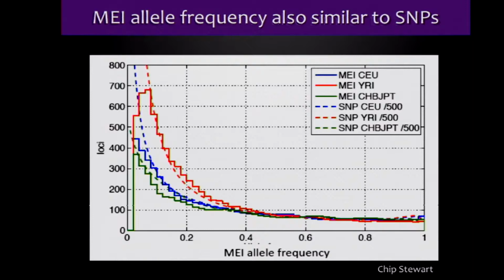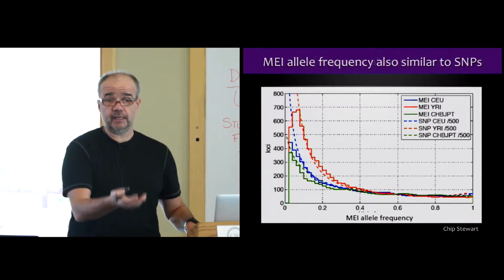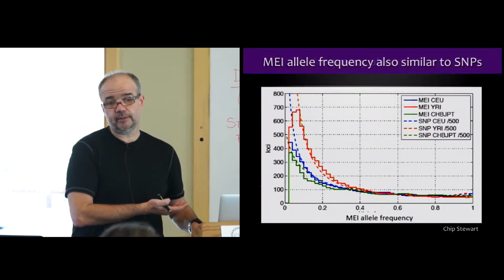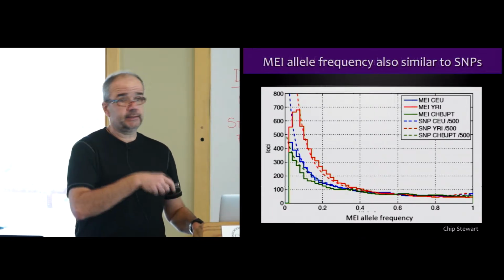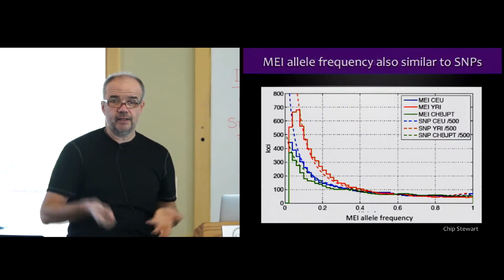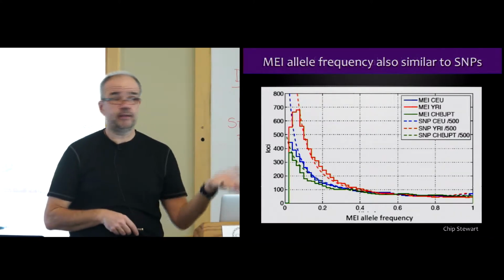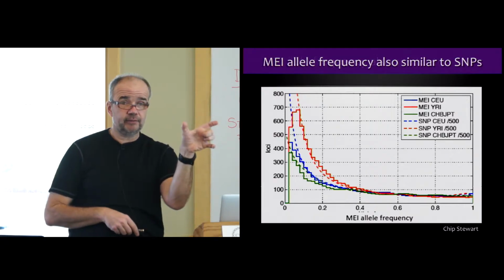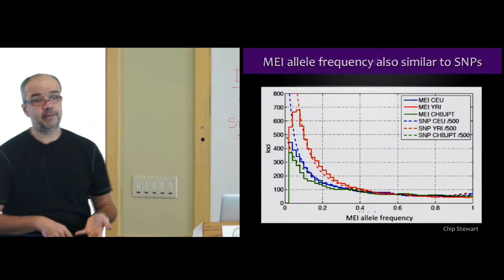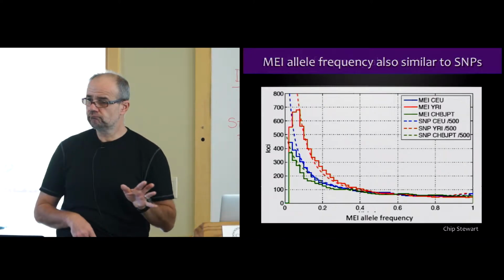It's super nice. Okay, so this just gives you an example of how you can go about this not using base alignment at all, but just these signatures in how you map the reads or pairs of reads to detect these elements. Then you can go back and validate them. You can design primers that read across the boundaries and experimentally validate the breakpoint sequences, the event boundary sequences, and you can be certain that those elements really are where you predicted them to be.